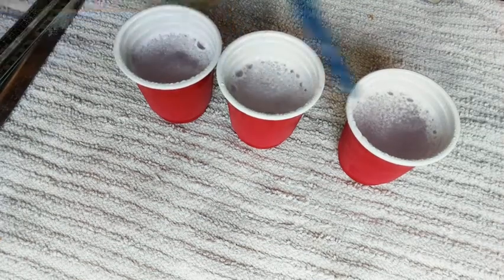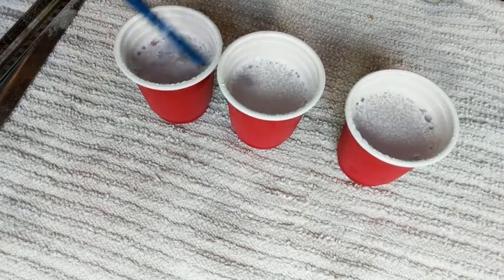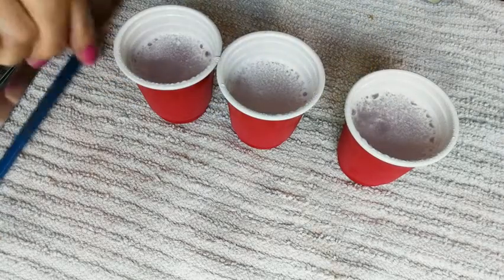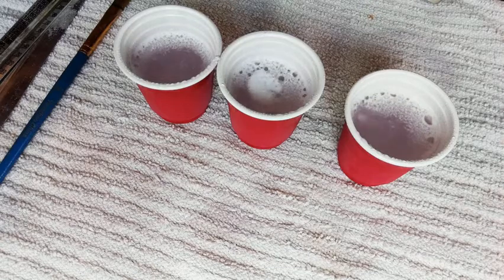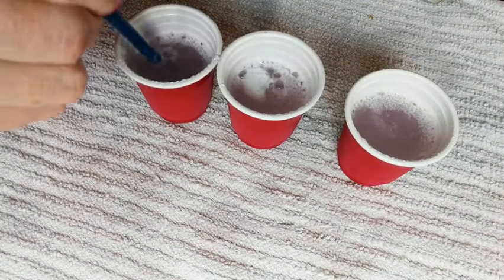Put some chunks at the bottom for all of these. Definitely getting towards the end though. There's that one surfaced, right? So now it's starting to float. That's where we start to get it to react a bit more, when it gets to that point of floating.